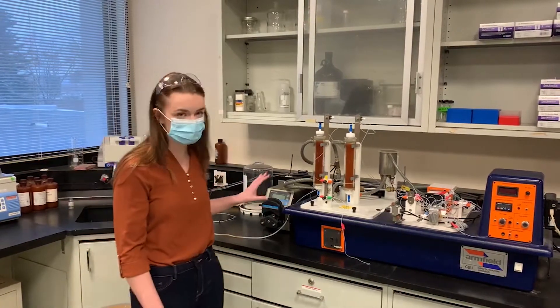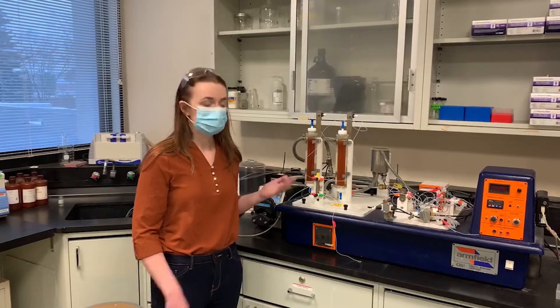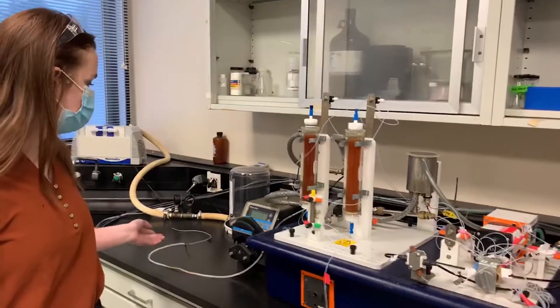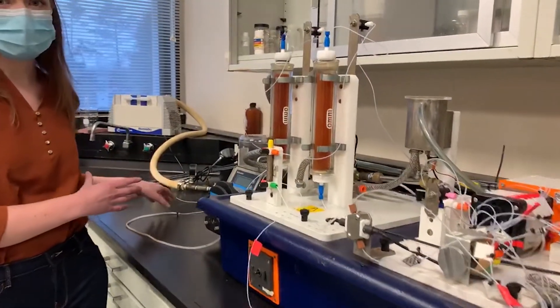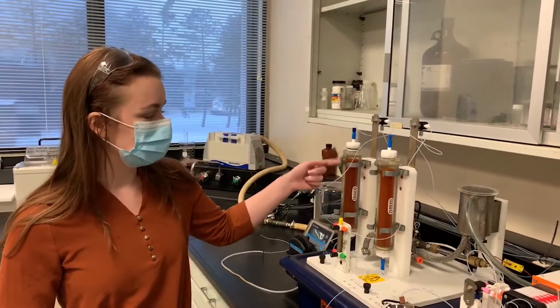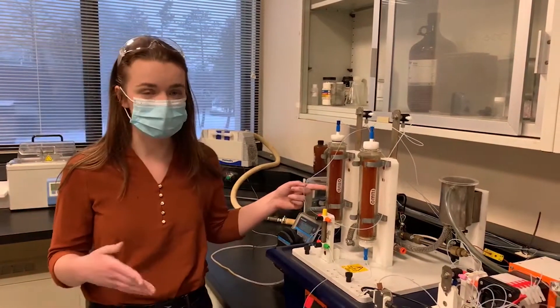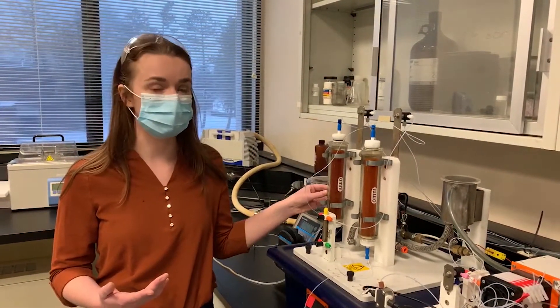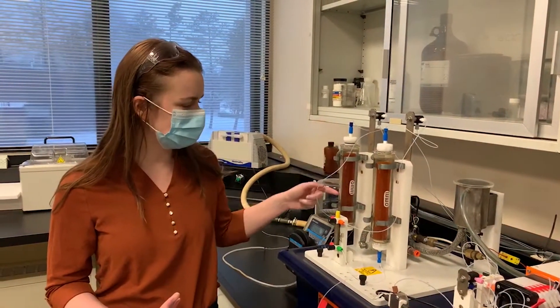We use the bench-top scale, basically like Professor Schwartz said, to do this on a more manageable level and really get a feel for how things work. You would have something like your feed container with your sucrose that you would feed into the reactor through a tube. In here is a packed catalyst which actually reacts what you're feeding into your reactor, and it's heated through the outer shell of the tube with hot water.